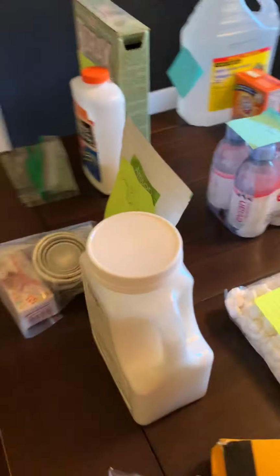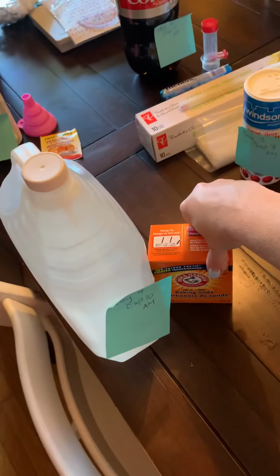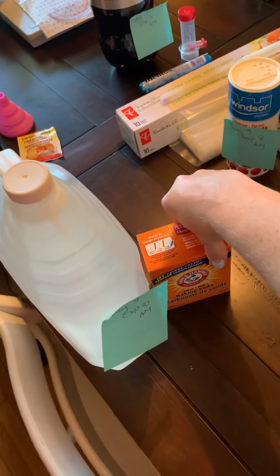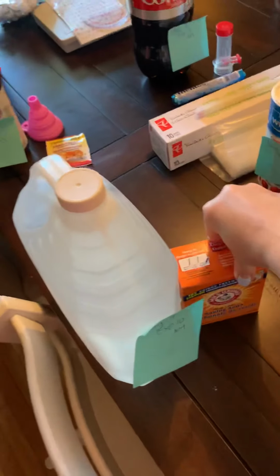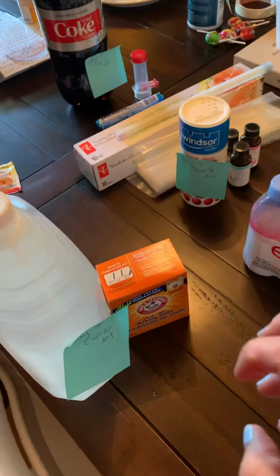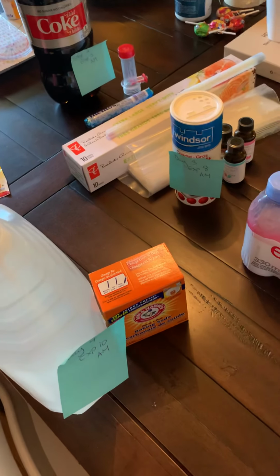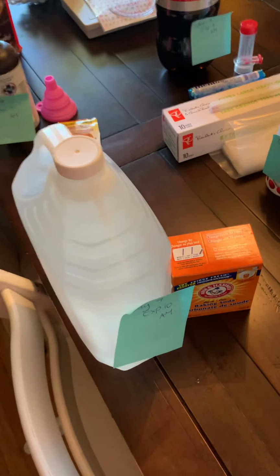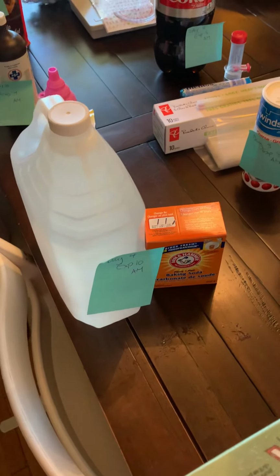And day 4, this looks like a vinegar and baking soda volcano. It's not, we're gonna add them slowly and heat them up, and I'm gonna actually make sodium acetate from this. And then you can cool it down. So when you heat it up and boil it, it's saturated, and then when you cool it down, it becomes supersaturated, but it doesn't really change to crystals unless you agitate it. So we're gonna agitate it a little bit and crystallize it out and make what's called hot ice. It's not really ice though, it's sodium acetate, because again, that takes a little bit of time.